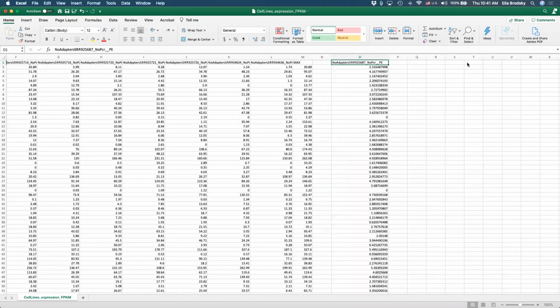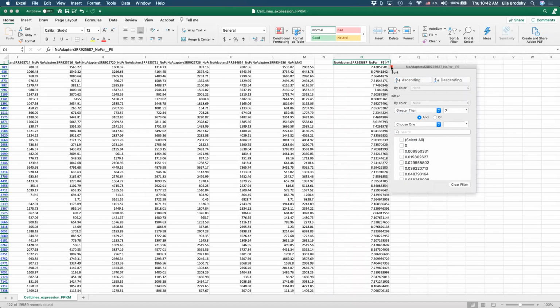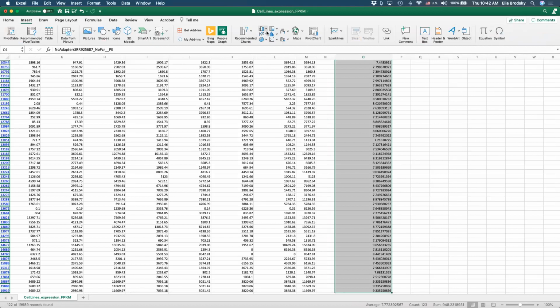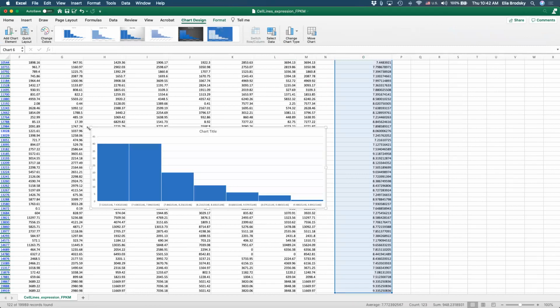So let's do a filter here, and let's set it to greater than, let's say, this is in log scale, so let's do 7. Okay, and let's see what now happened to our data. Maybe 7 is too much.